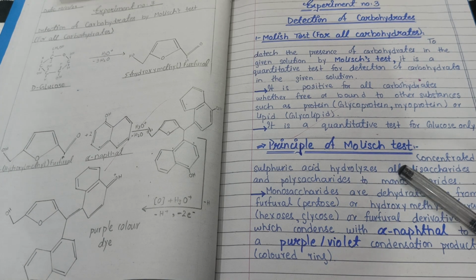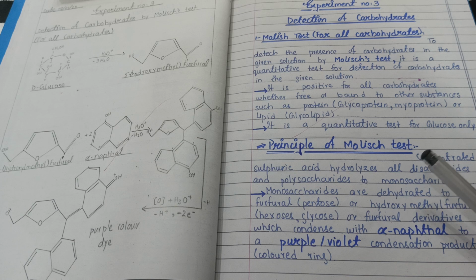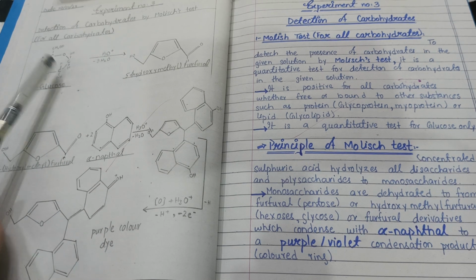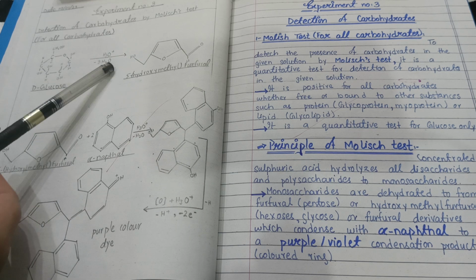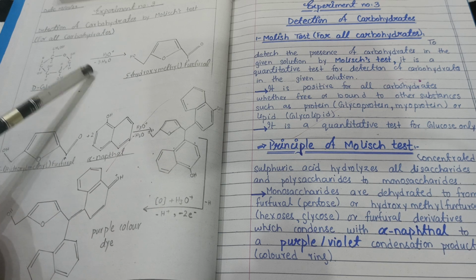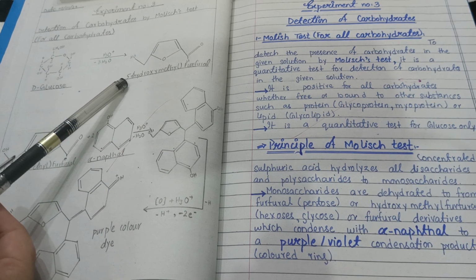So what will be the principle of this test? The principle is very simple. First of all, you have to dehydrate your sugar. For example, here we have D-glucose, a sugar. What we are doing is removing water from it. As a result, we gain 5-hydroxymethyl furfural.